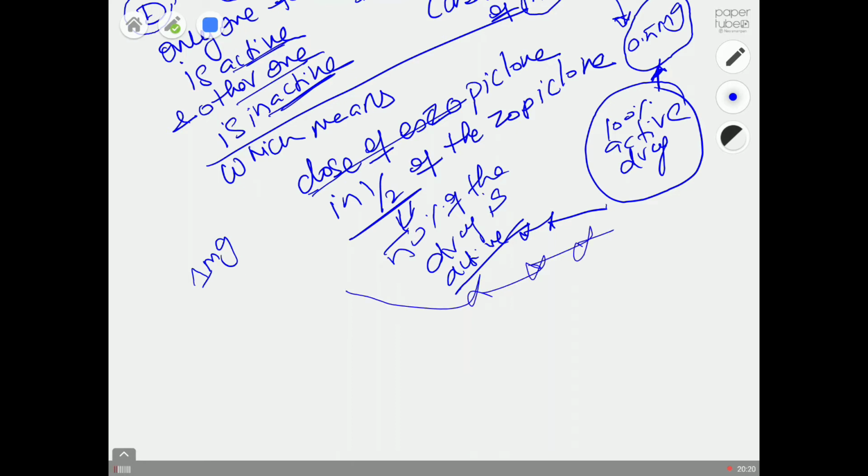This is extremely important. So that's why for your lab, I designed this crystal growth experiment. What we did in the lab is we used a normal API, which is paracetamol. What we are going to learn through this experiment is how to perform a crystal growth experiment.